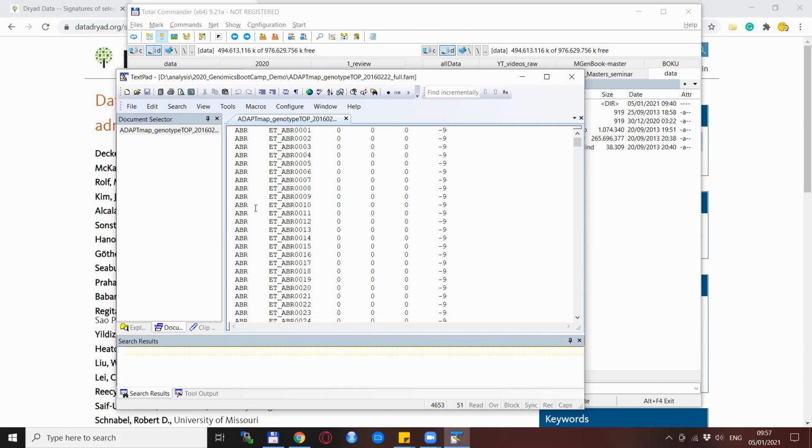Also in this case, the authors decided to go with using this column for breeds, and so there are breed abbreviations from all around the world, and in the publication you can actually find out what these abbreviations mean. The second column is also very important, the so-called individual ID, and it should be unique for each individual, for each animal in this case.